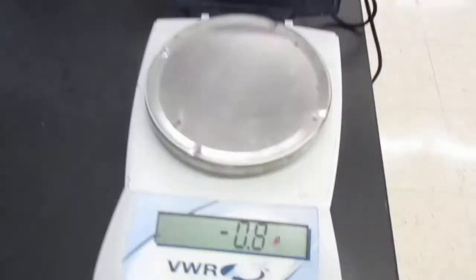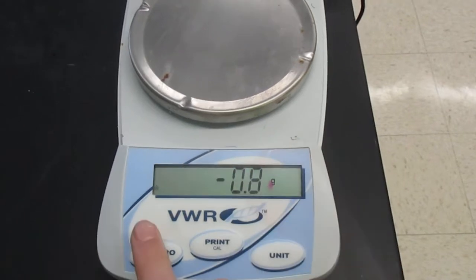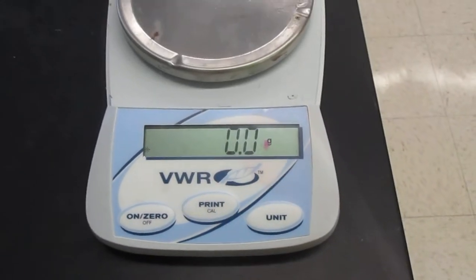However, before I do that, I was looking at my balance and I saw that it said negative 0.8. So this has not been zeroed. To do that, you just want to click the zero button and it resets the math.